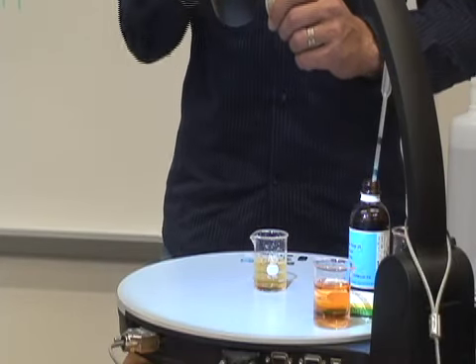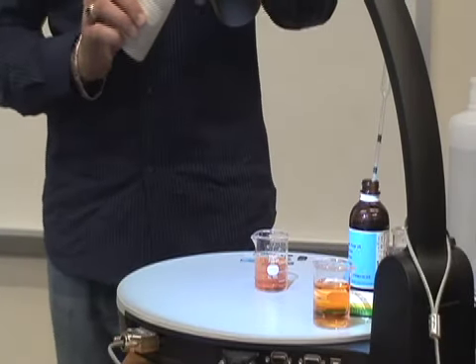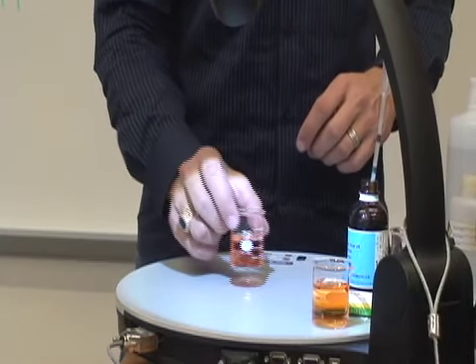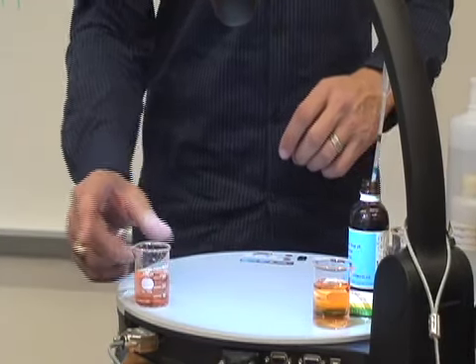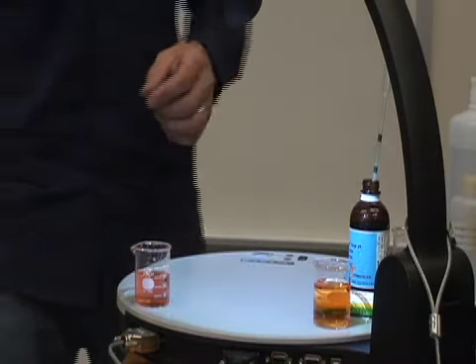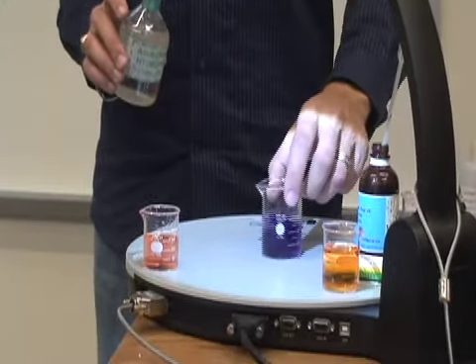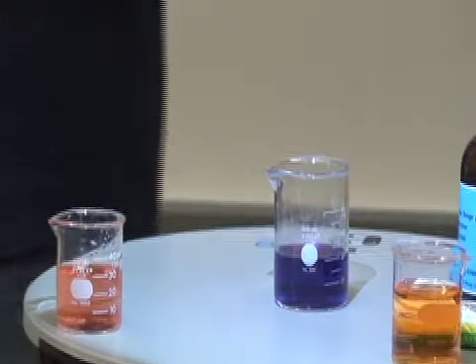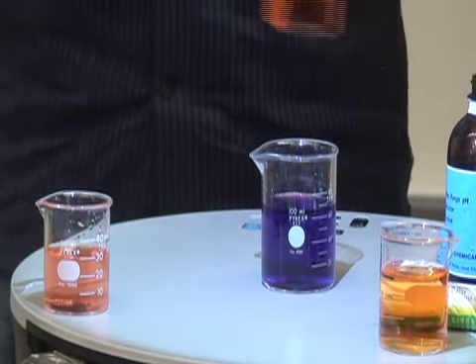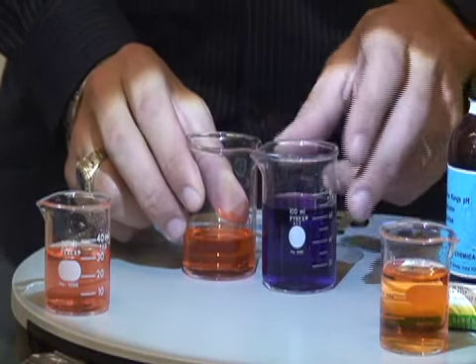So now, what do you think is going to happen when I throw in a little vinegar? So far, we tend to be doing a lot of acid kind of things, don't we? So, vinegar also acidic. This is ammonia, or ammonium hydroxide. What's ammonia? It's a base. What did we have in this beaker? That was the hydrochloric acid one, right? So this is acidic and that's basic, isn't it?